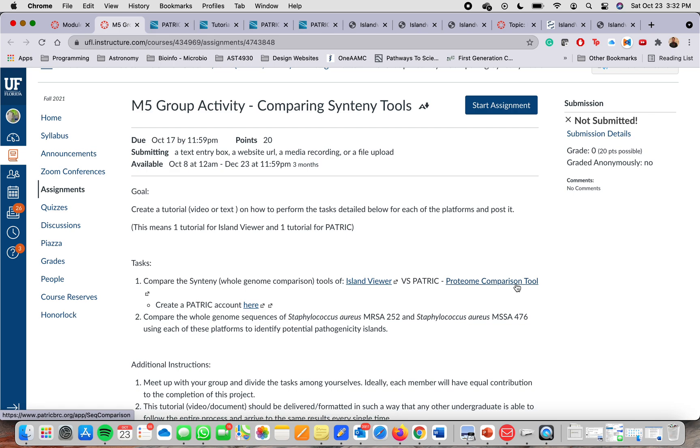So these tools can also be found by just typing their names on Google and doing a quick search to find the main website.